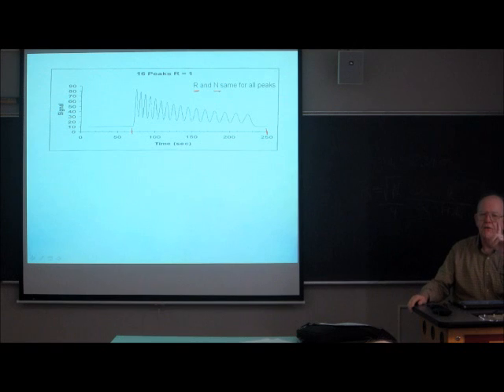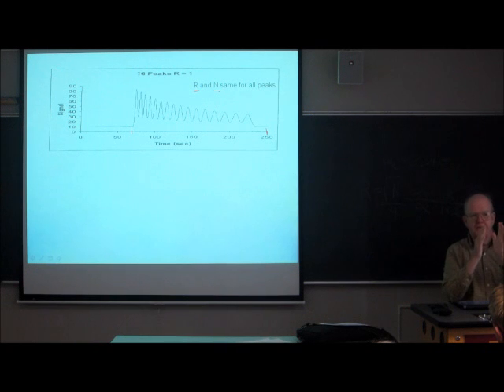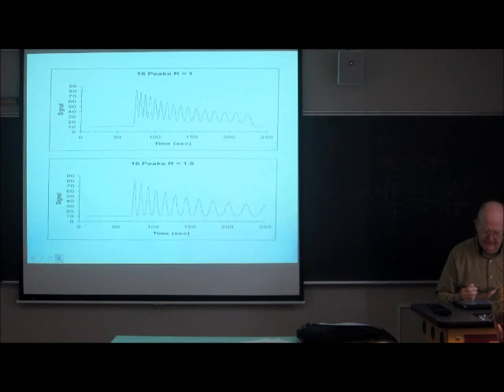Now suppose I said I'm not satisfied with a resolution of 1. I want to have a resolution of 1.5. The peaks are going to have to be further apart, aren't they? So I'm not going to be able to fit as many peaks in the same space. And here's a resolution of 1.5. You can see it's a much better resolution because that's just getting down to baseline. And I have a peak capacity now of 1, 2, 3, 4, 5, 6, 7, 8, 9, 10, 11, 11 and a half.